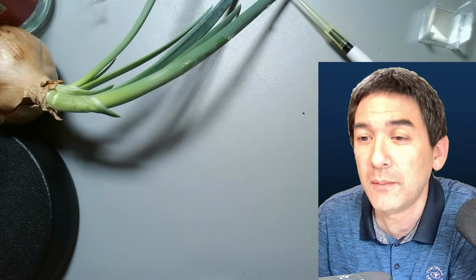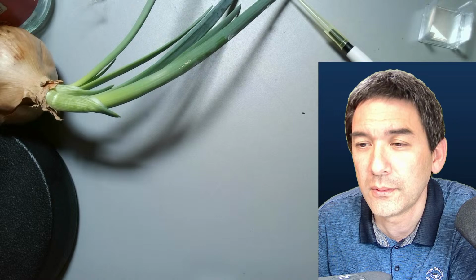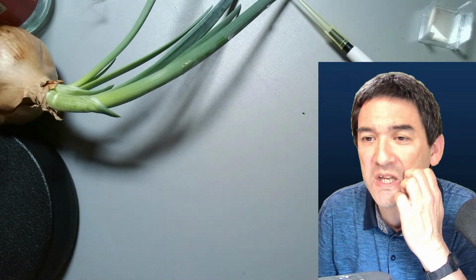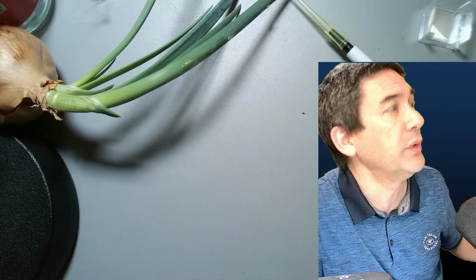Okay, yeah. So that's again the Olympus Canon kind of thing. Does the microscope camera use a C-mount? No. Good question. I just want to explain this a little bit, and I'm going to show you.